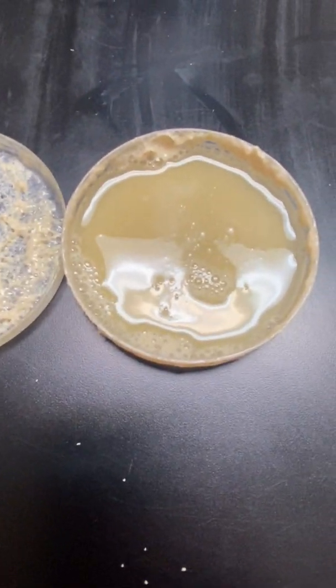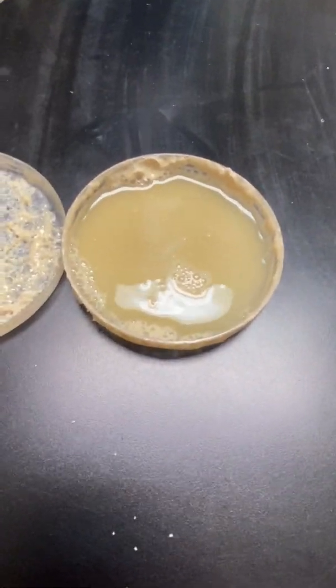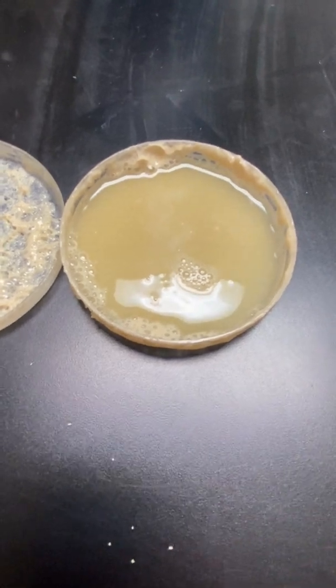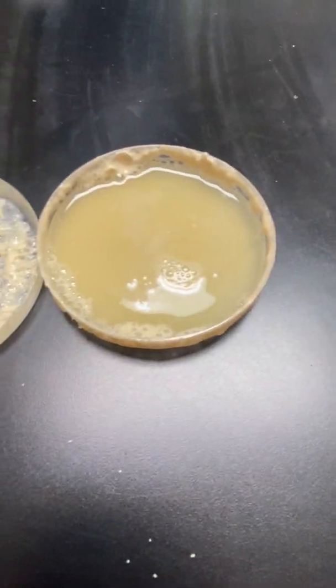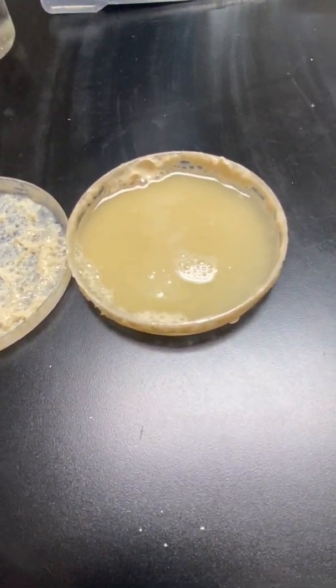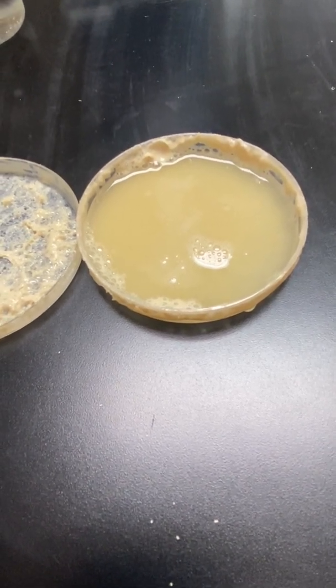Now for number 3. If you could smell this, it kind of smells like beer, alcohol, maybe like vinegar, apple cider vinegar. It has more of a vinegar alcohol smell to it. You smelled it, so record that observation. You're going to do one more observation for number, oh sorry, this wasn't for number 3. This was for number 6.